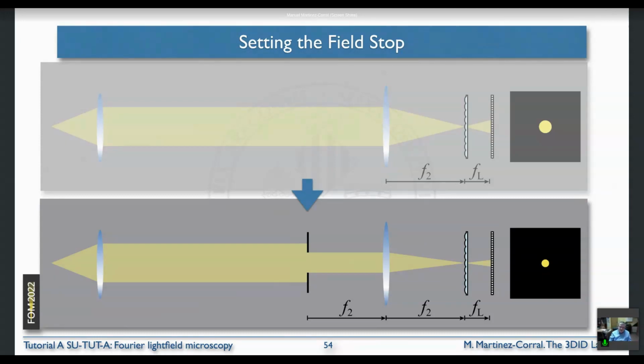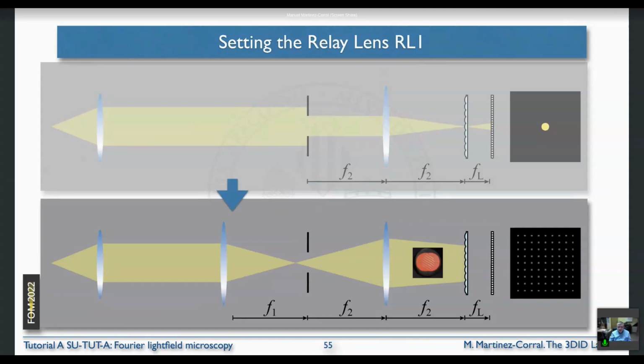Next step is to fix the first lens of the relay system. So this is still parallel. We don't need to check every time. We make sure that this is perpendicular to the optical axis, and then we can move it. And here we have a double check.